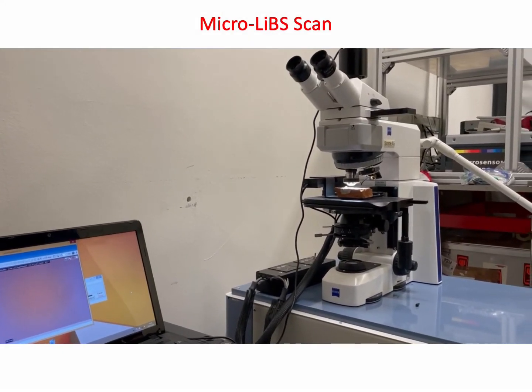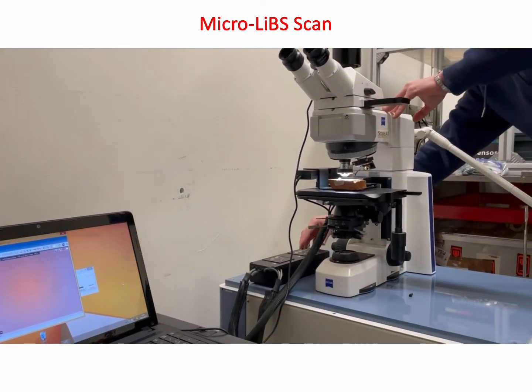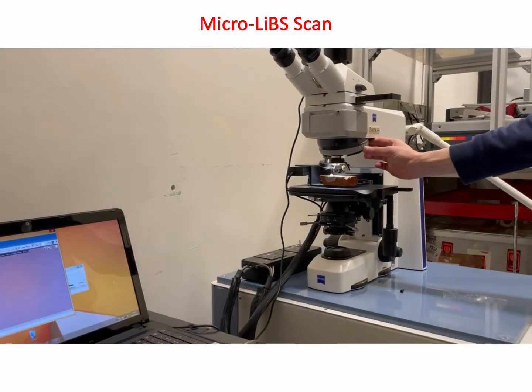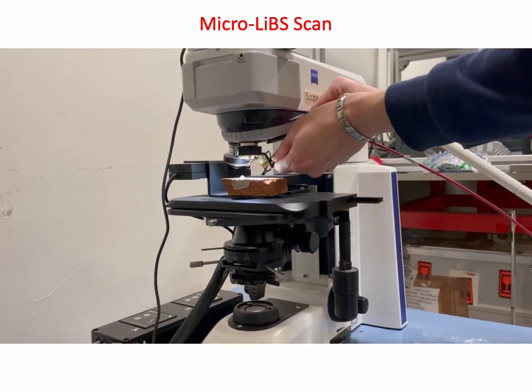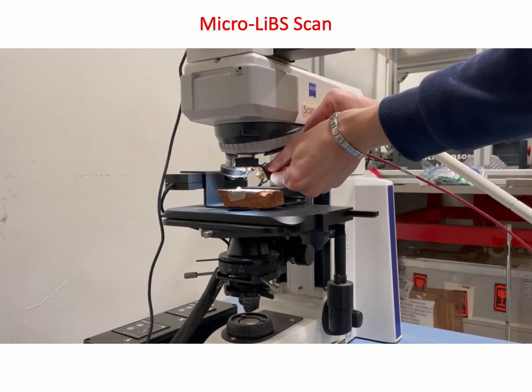To make the measurements, it is necessary to use a proper microscope objective that is strong enough for the laser beam, whose wavelength is in the infrared region. So, we also must adjust the focus, the corresponding position in the infrared being slightly different than in the visible.